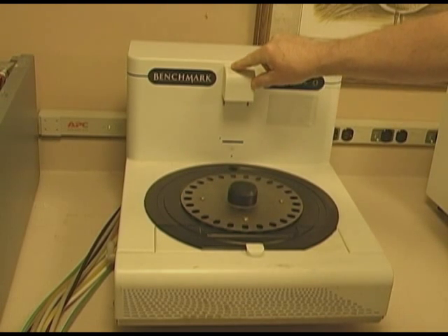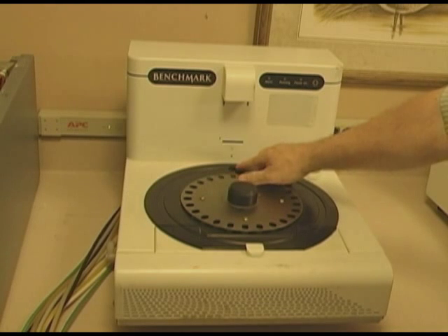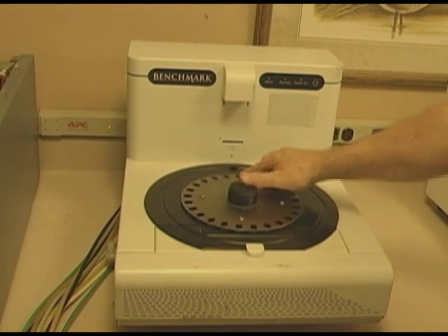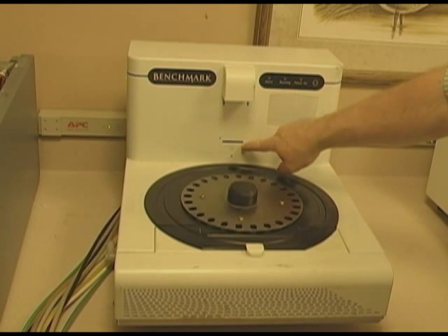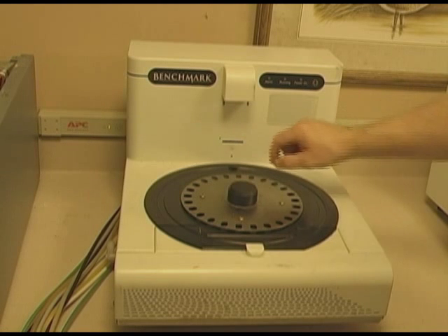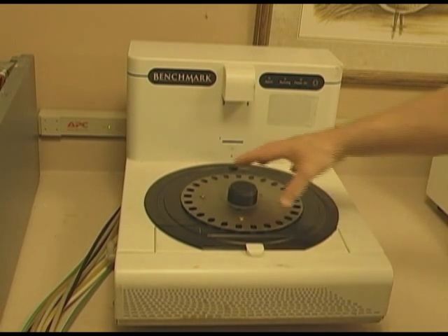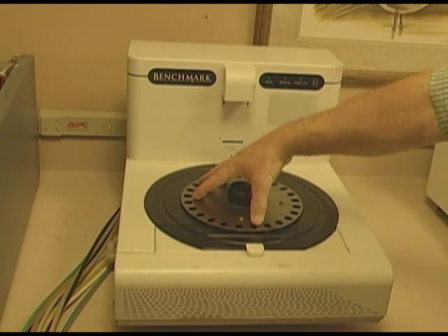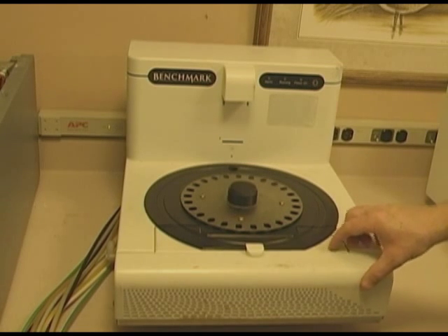Above here is a dispenser — it's a pneumatic dispenser and simply a solenoid, which when the reagent comes over the slide that it wants to put a reagent on, it simply comes down and pushes out a sample. You'll also notice that there's a slot for the barcode reader, which reads both the reagent in the carousel and the slides on the slide carousel.